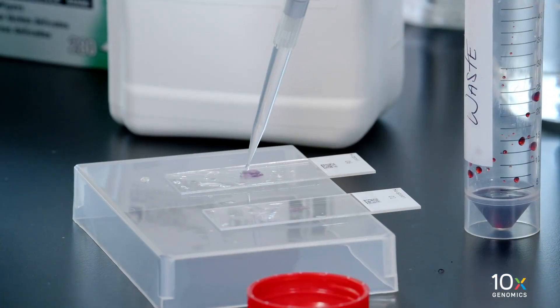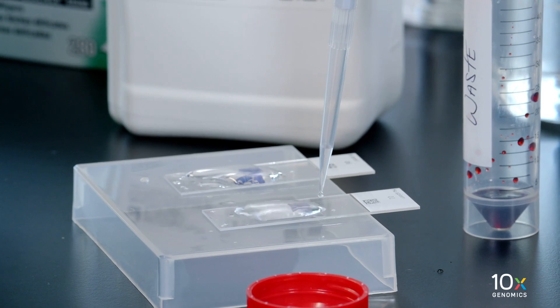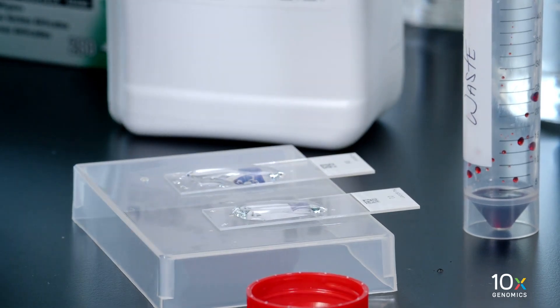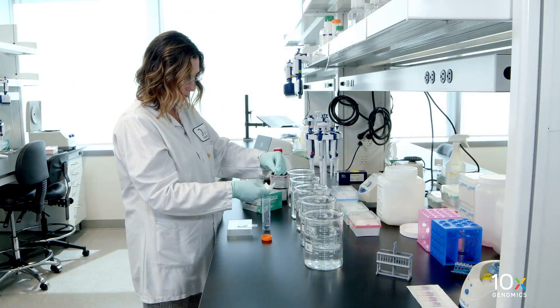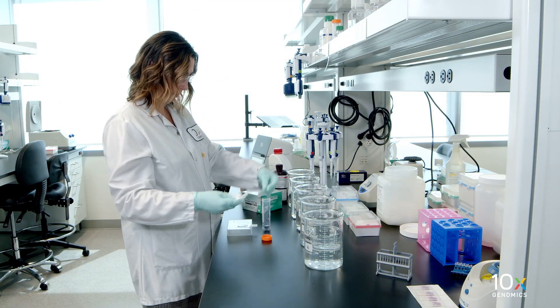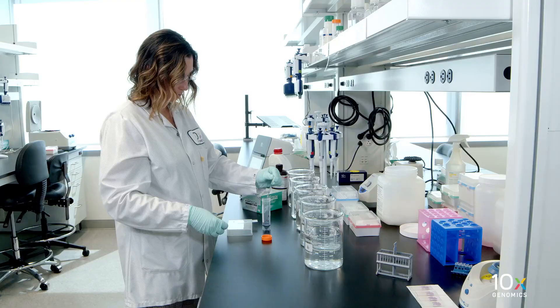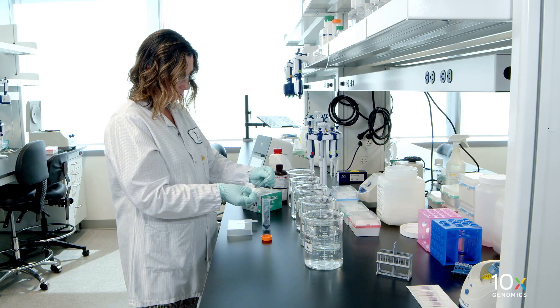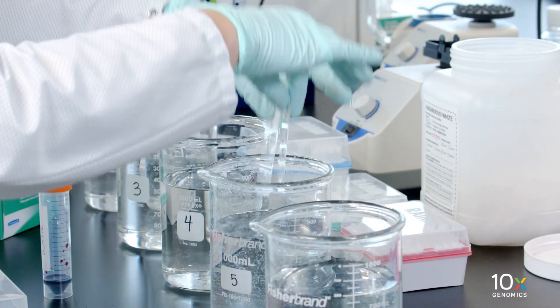Add 1 milliliter of bluing buffer per slide to uniformly cover all tissue sections. Incubate for 1 minute at room temperature. Discard the reagent from each slide by draining and/or holding the slide at an angle, with the bottom edge in contact with a laboratory wipe. Dip the slide 15 times in beaker 5.